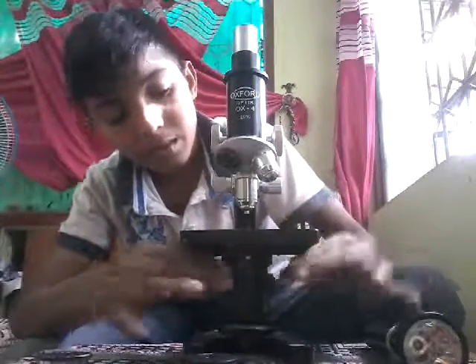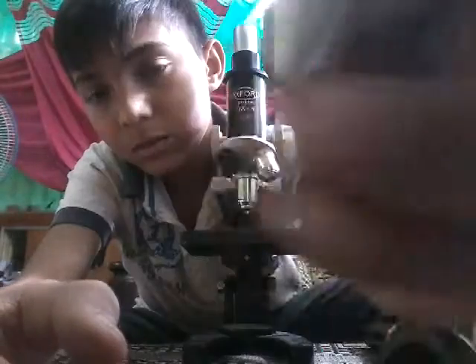Okay, guys. And this is for the light, guys. Light to pass. You don't want the light, you can close it like this, and again you can open it. Okay, guys, you can close it, then you can open it. See, guys, you can't see from it, it's very minor. From this also, it's too magnified.